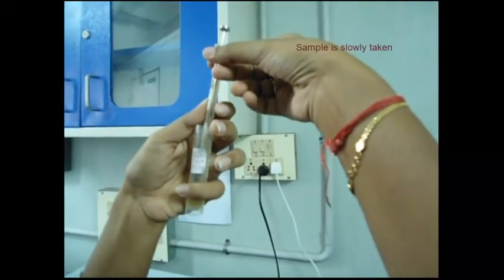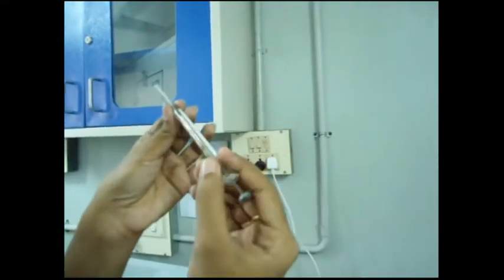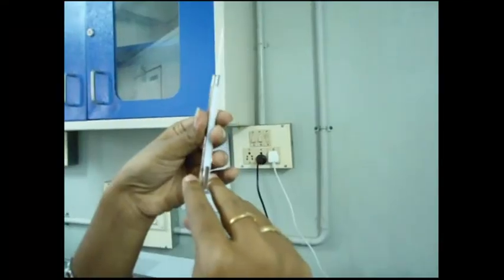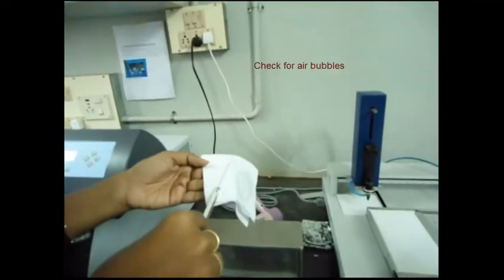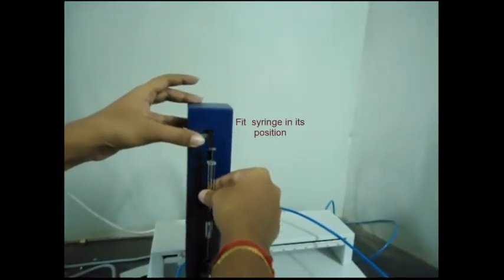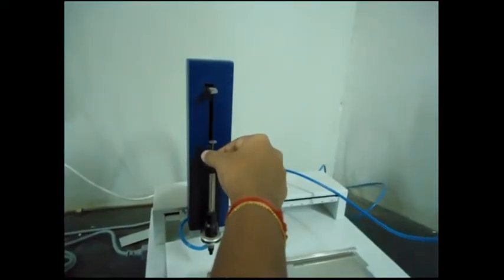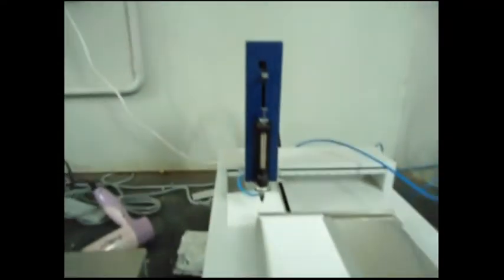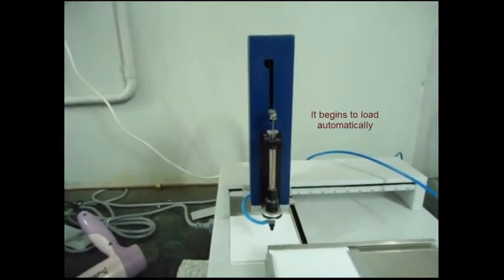Samples are carefully taken with a special syringe. Check it for air bubbles. Wipe it with tissue paper, then fit the syringe in its position in the sample injector. It automatically allows the syringe to load the sample.